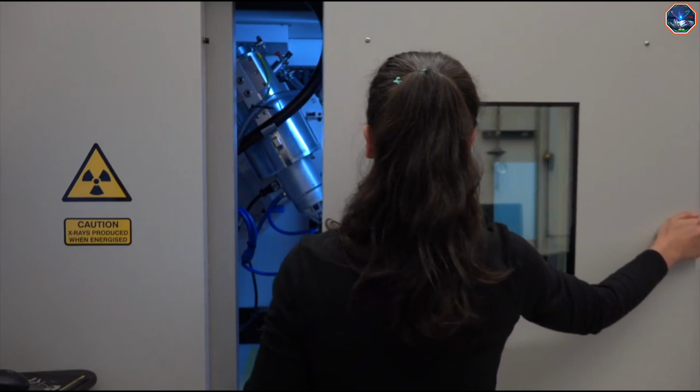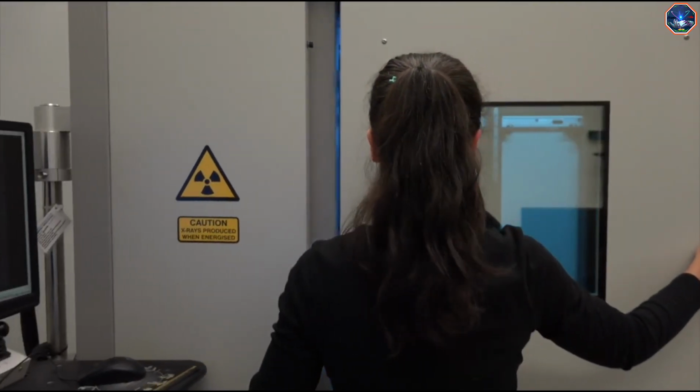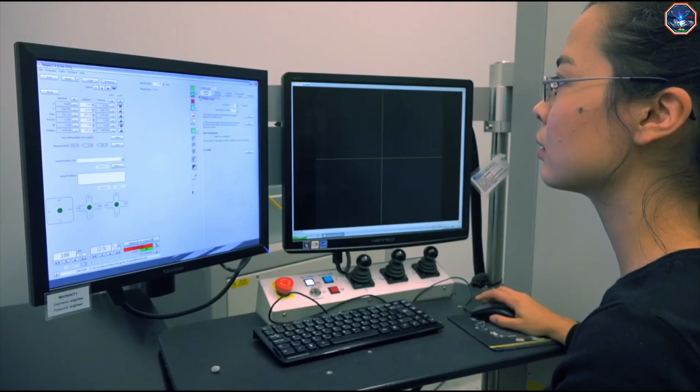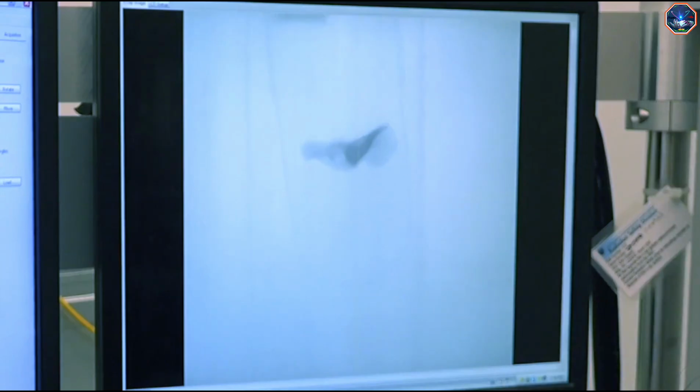Using micro-CT scanner lets us make a digital copy of the fossil so that we can virtually manipulate it. We can blow it up to any size on the computer so that anatomical features can be more easily seen and measured, and the CT scans help us preserve and archive these fossils digitally in case a fossil is accidentally lost or broken in the future.